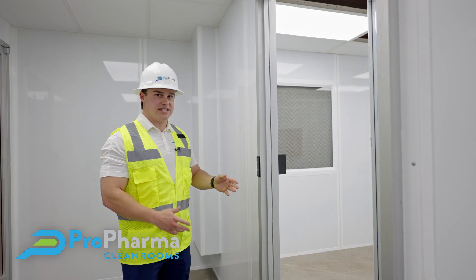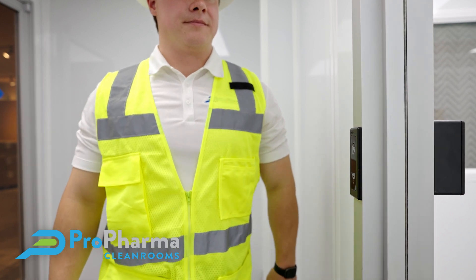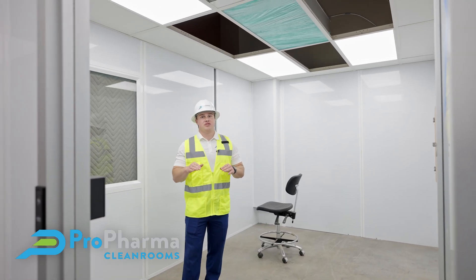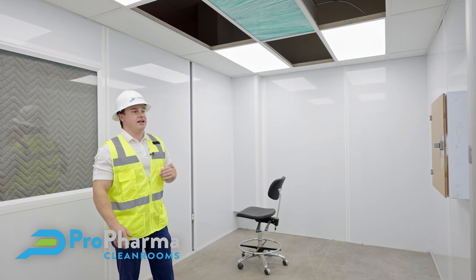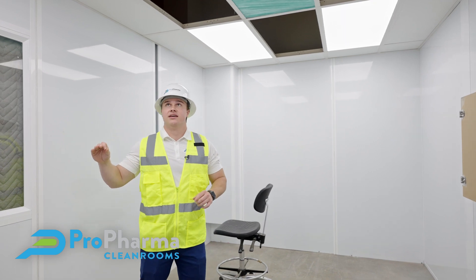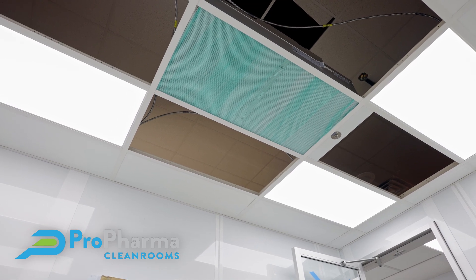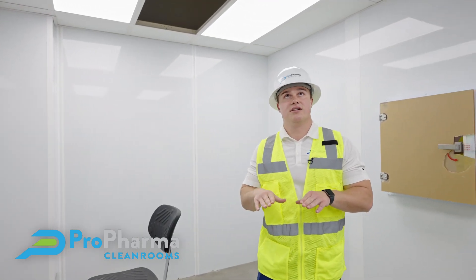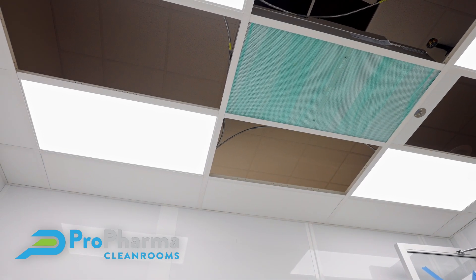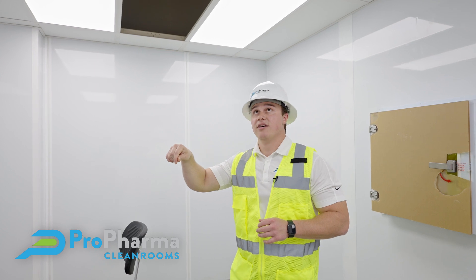Walking in here, you can see this wave plate is designed so you can go in and out of the rooms without dirtying up your hands or any of the equipment in the room — a very important piece of this. We have our ceiling grid in, our lights dropped, and our HEPAs dropped. Our ceiling is set at seven foot ten. These lights are clean room grade, meaning they are very smooth and have a gasket sitting in the ceiling grid that seals them to meet USP standard. These clean room ceiling tiles are also a clean room grade, with a very smooth, easily cleanable surface, and they are siliconed down to the ceiling grid throughout this project.